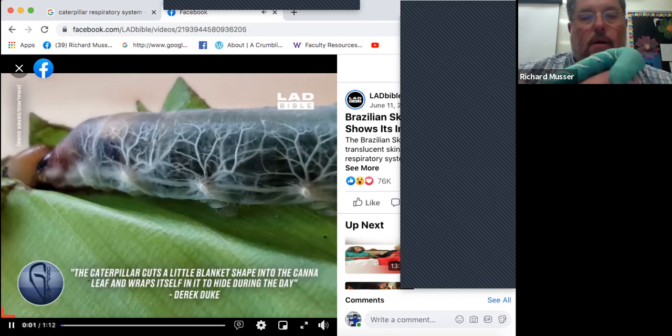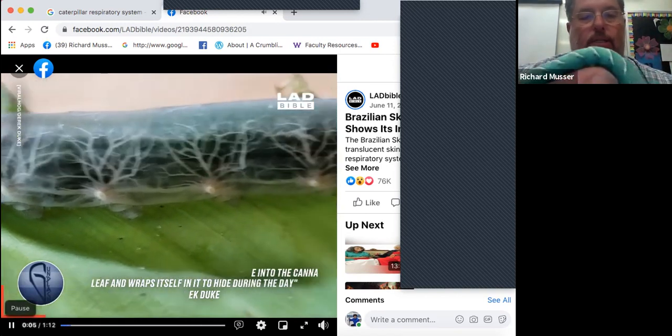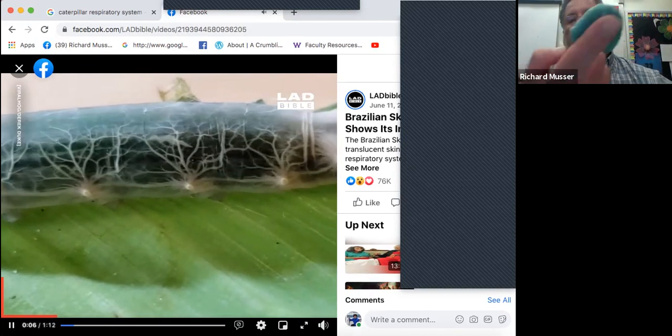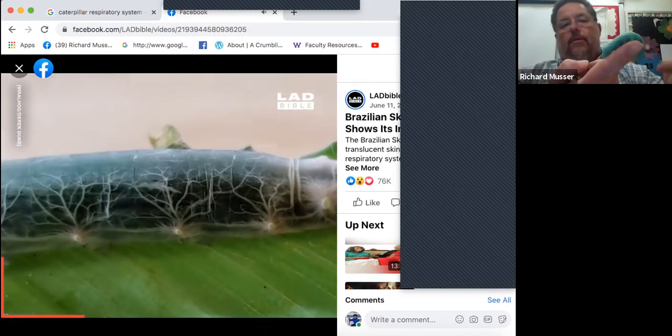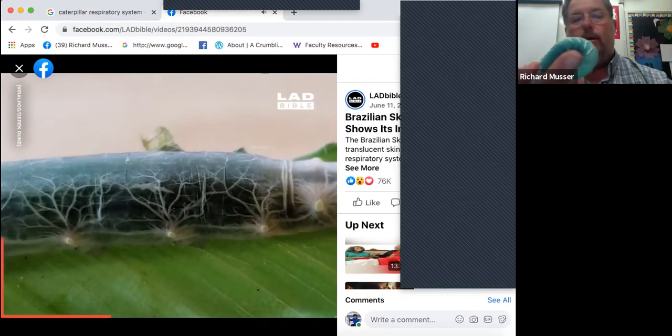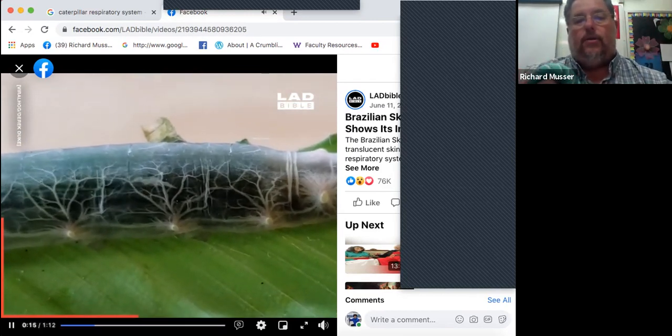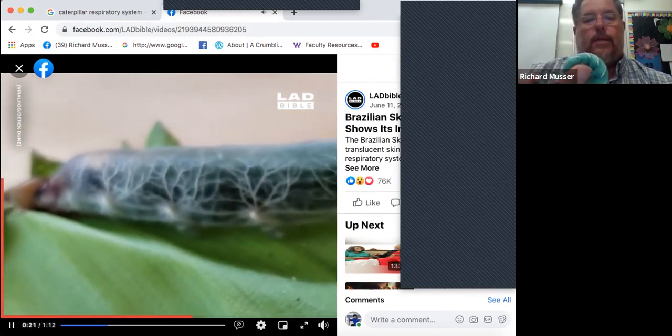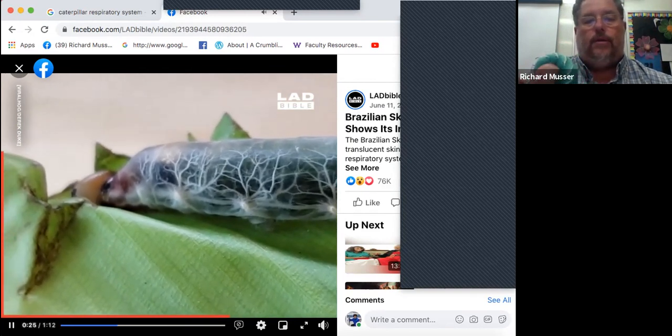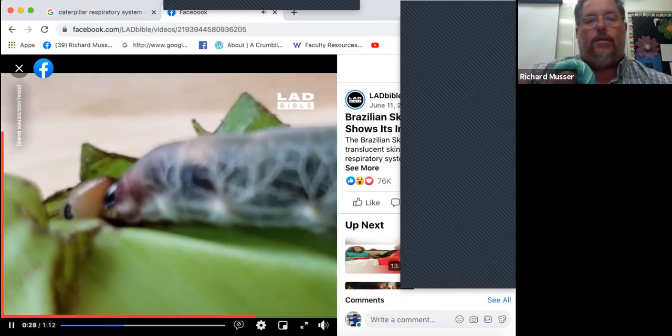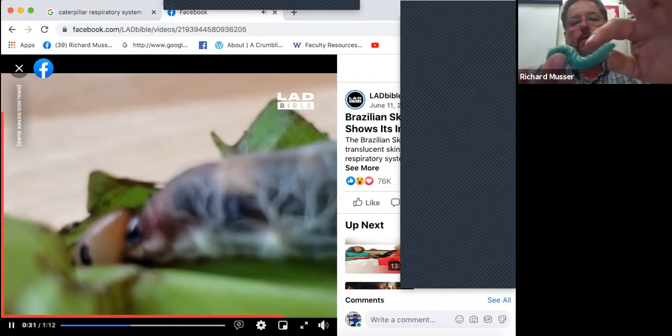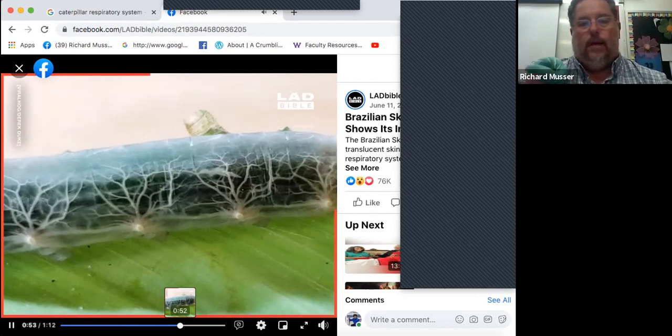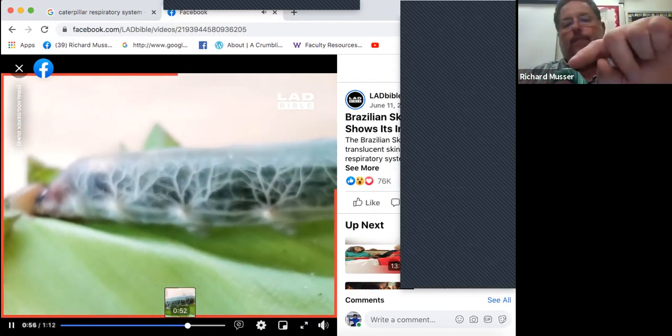Check out this caterpillar here. You can see the midgut's moving, the digestive system's moving, and it's moving the air tubes around, these trachea and tracheoles. Basically it's a tube inside this caterpillar from mouth to anus, a tube within a tube. Look at the trachea moving around and the tracheoles. That's really cool to be able to see inside. You can see the head up here. Here's the true legs, here's the foregut, the midgut would be in the middle, and the hindgut at the end.